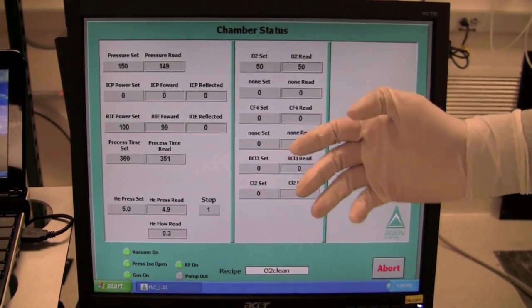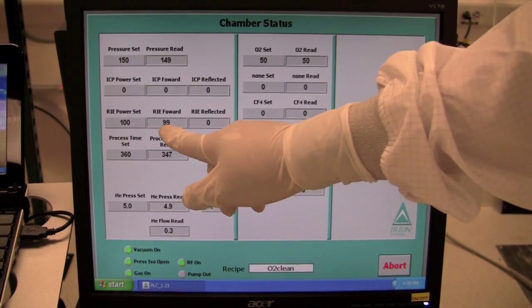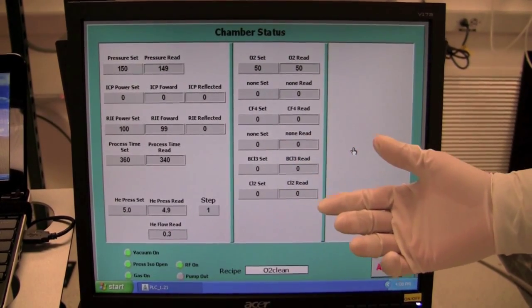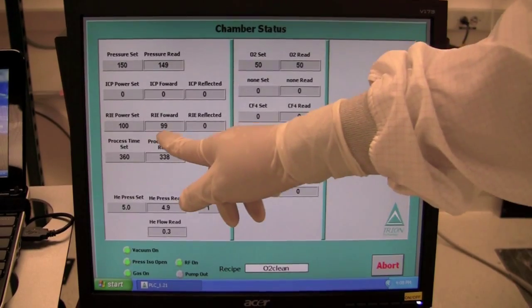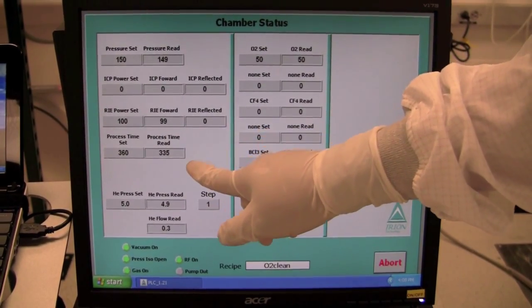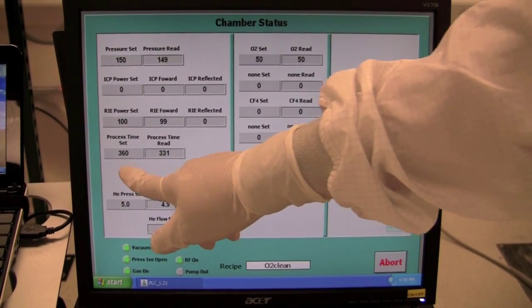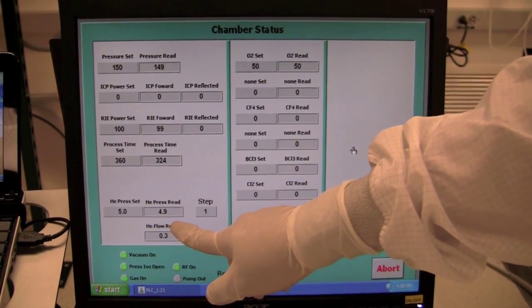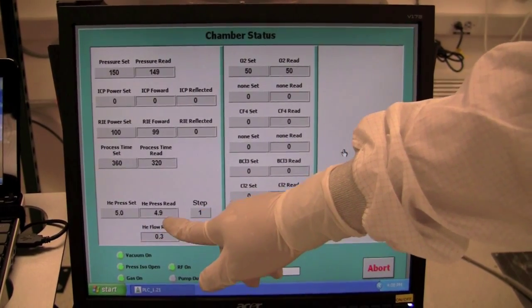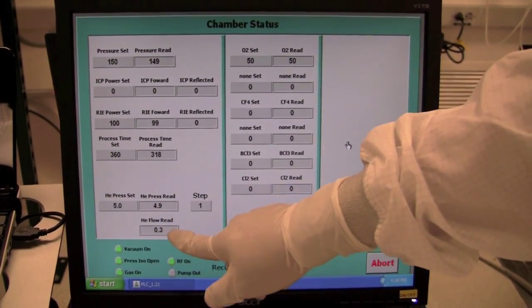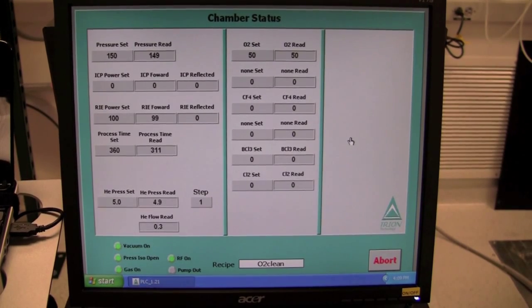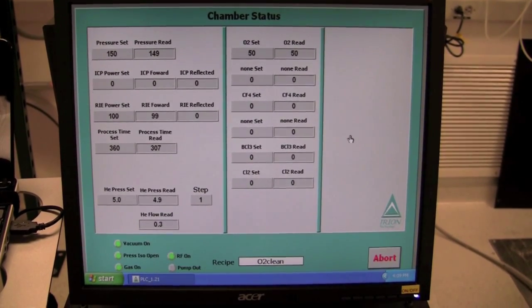Notice how there's a reflective for a few seconds and now it's back to zero. Reflective is more about what power is lost. So, if your power, let's say, is 98 forward and two reflected, you're losing essentially two watts of power. And this can affect your etch rate and a couple of other process optimizations that you may have in the past. So, it's very important to keep an eye out for these few parameters. Once everything is stabilized, you'll see that the process time begins ticking down. So, we have set it at 360 and it's ticking down. Back here we have a couple more parameters. We have helium, which is going to be the backside cooling on your sample. It's set at about 5 and it's going to be... It's pretty typical to see it drop down to 4.9. It's okay. The flow rate should be around 0.2. Right now it's 0.3, which is okay. Everything else looks fine. So, at this point, we're just waiting for the process to finish. This one happens to have two steps, so we're going to see that too. But, for now, we wait for the sample to finish.